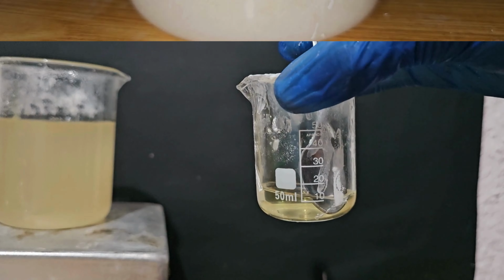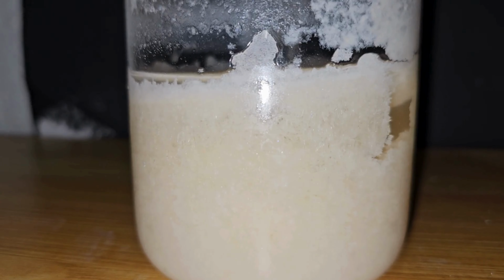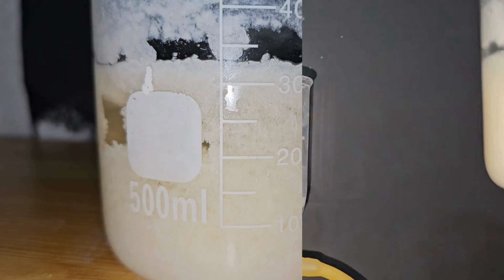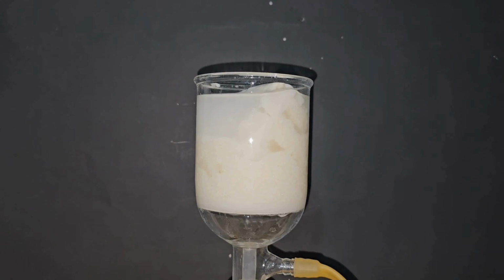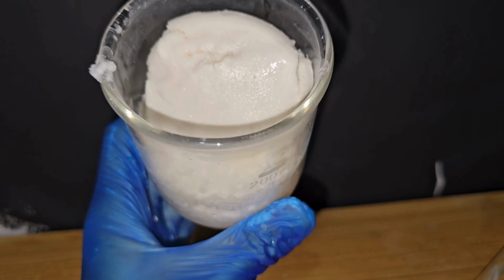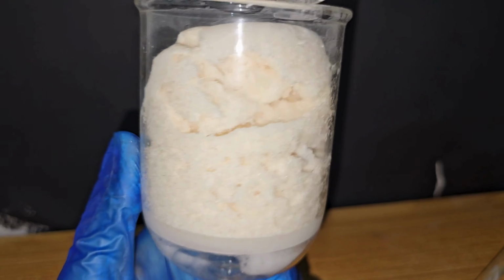I left the solution in a fridge for something like 2 or 3 hours, and when I returned, all this solid had recrystallized. I filtered the crystals, and unfortunately, some stearic acid stayed on the surface of the crystals, so I manually removed it using a spoon.